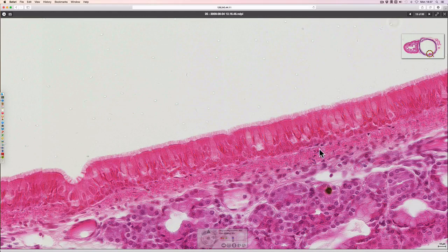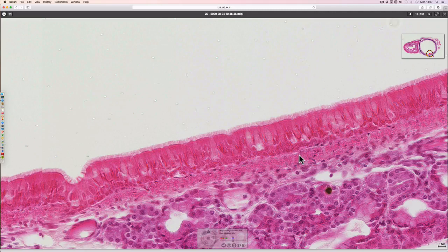It sits here on its basement membrane, underneath which is a lamina propria. The lamina propria provides structural and nutrient support for the epithelium.